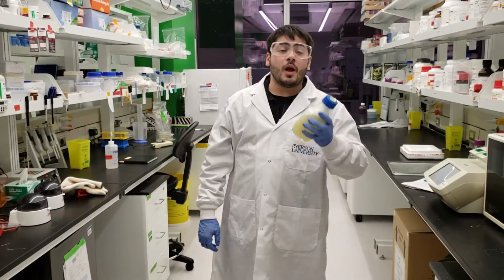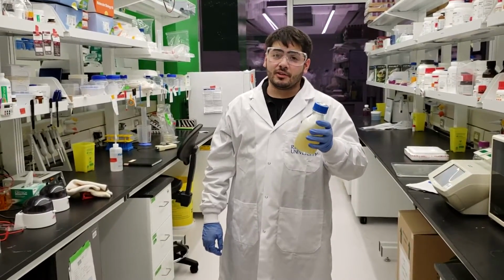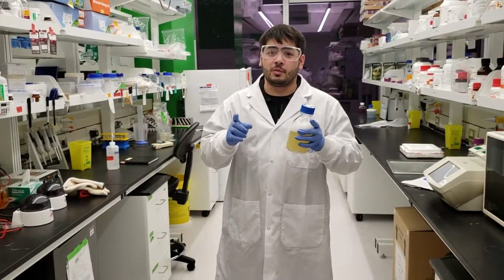What a workout. Once you're done shaking your solution extremely well, the next step is to have it sterilized in an autoclave. But maybe you should let your teacher or whoever's in charge of the lab handle this step because it requires a trained professional.